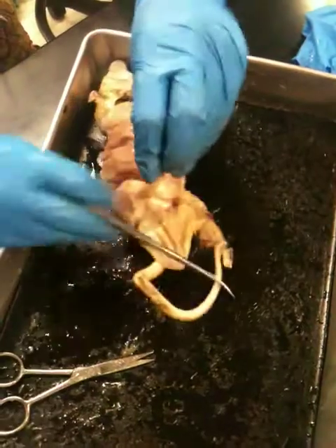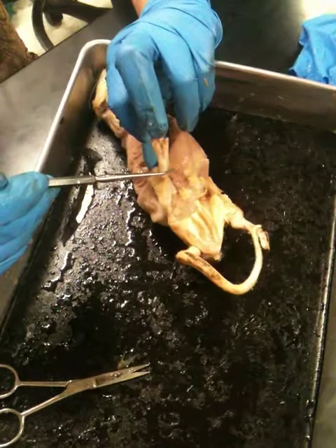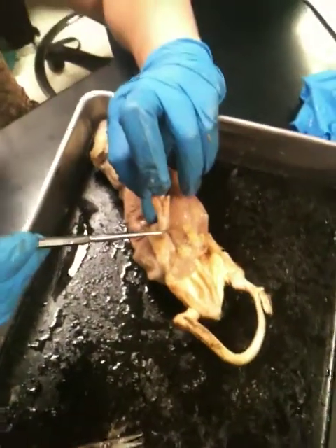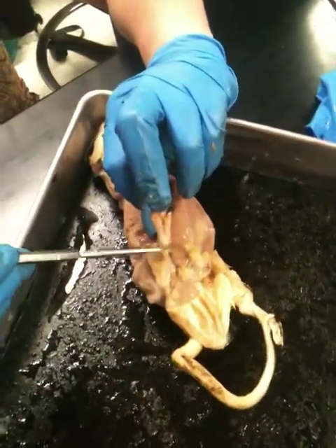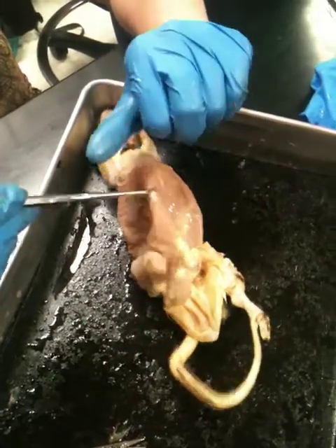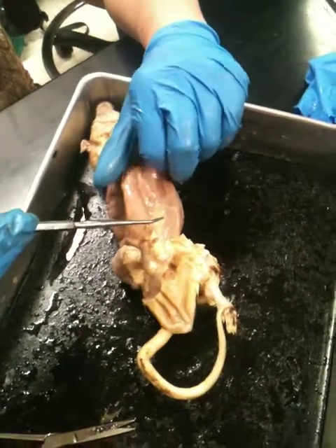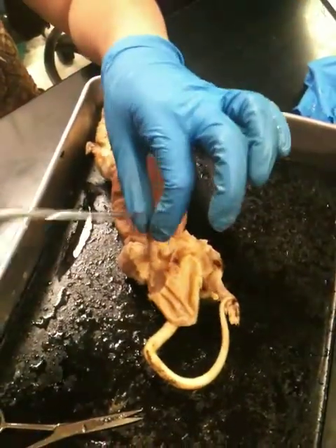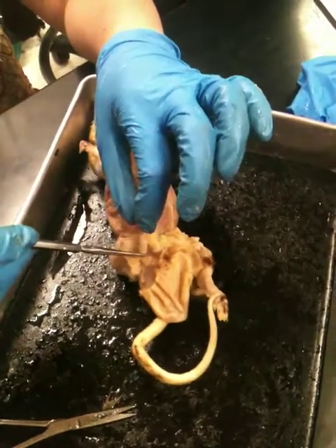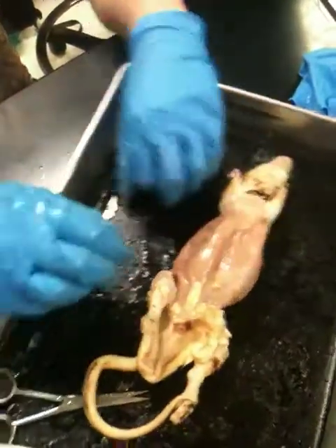This actual, it's a broken leg, but this actual tip right here, this is the heel. So calcaneal, heel, something like that. So calcaneal is right over here. Plantar is right here, and then of course digital are just going to be the toes at this point. And it's a cool fact because rats don't walk on their heels like we do, they walk on their tippy toes. They're always wearing imaginary high heels.